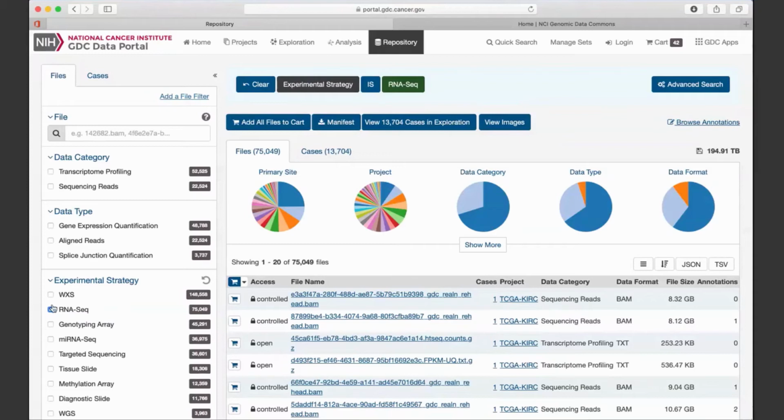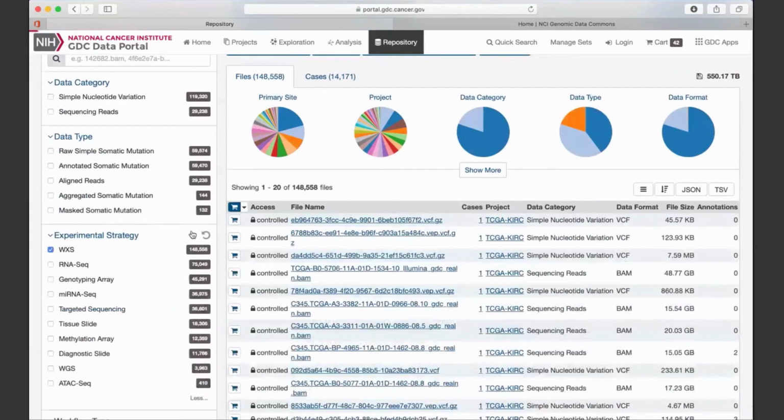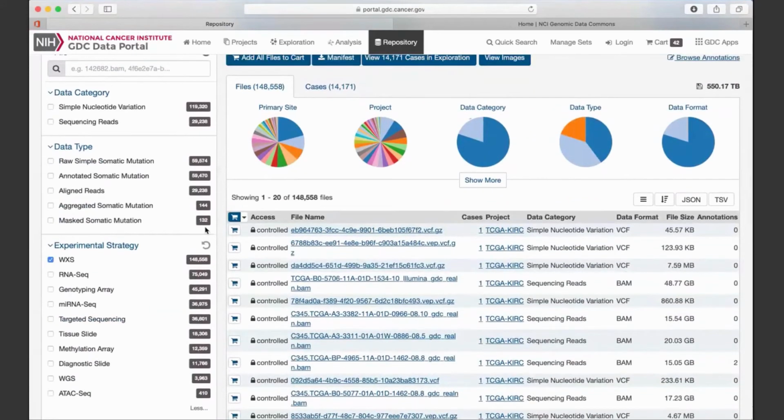So if there are filter columns saying it's bad quality or germline leaking, we won't take it. For every caller, we keep a list of good variants, and then we apply a rule called the two-callers criteria. We only allow mutations to get into our public access MAFs when they are called by two or more callers.